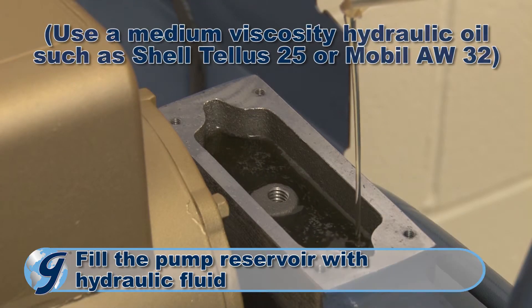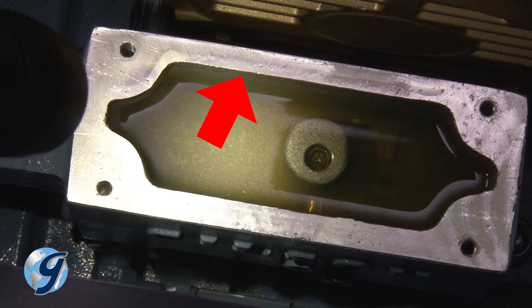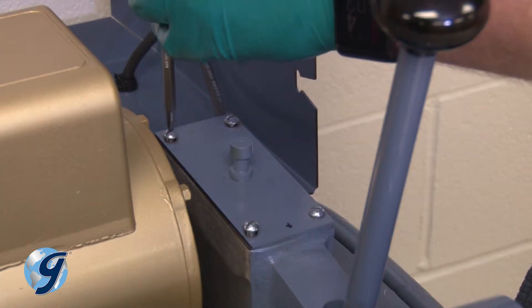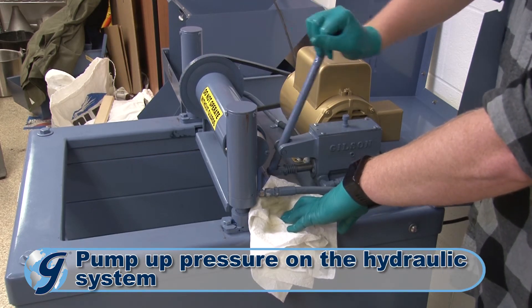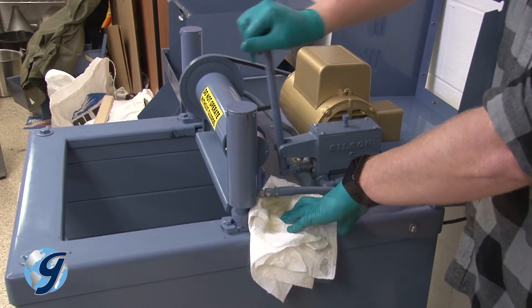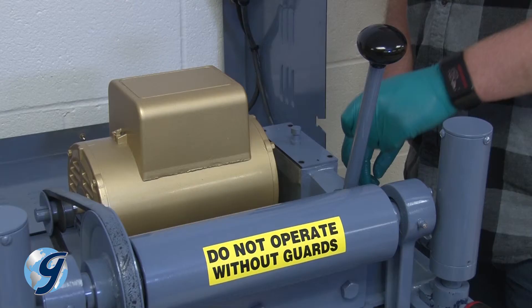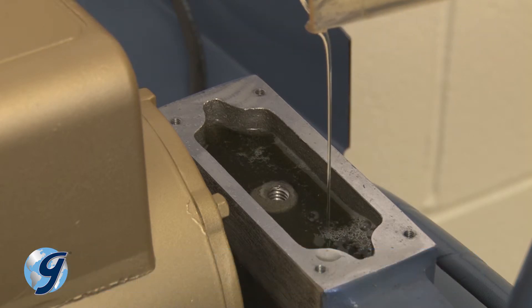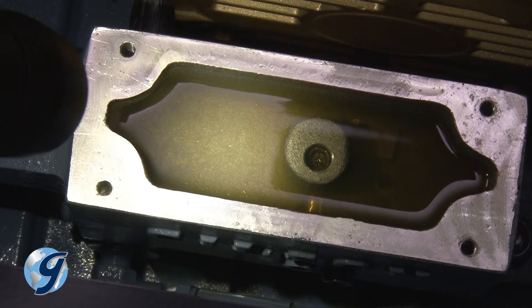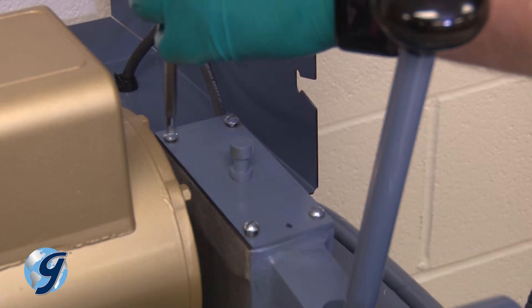Fill the pump reservoir with hydraulic fluid to within one quarter inch from the top. Once you have confirmed the hydraulic oil is a quarter inch from the top, reinstall the pump cover assembly in the same orientation as it was before its removal. Pump up pressure on the hydraulic system with short strokes on the pump handle. Now, release the pressure by moving the handle all the way towards the front of the machine. Remove the pump cover and add more hydraulic oil if necessary to fill the pump reservoir to within a quarter inch from the top, then reinstall the pump cover assembly.